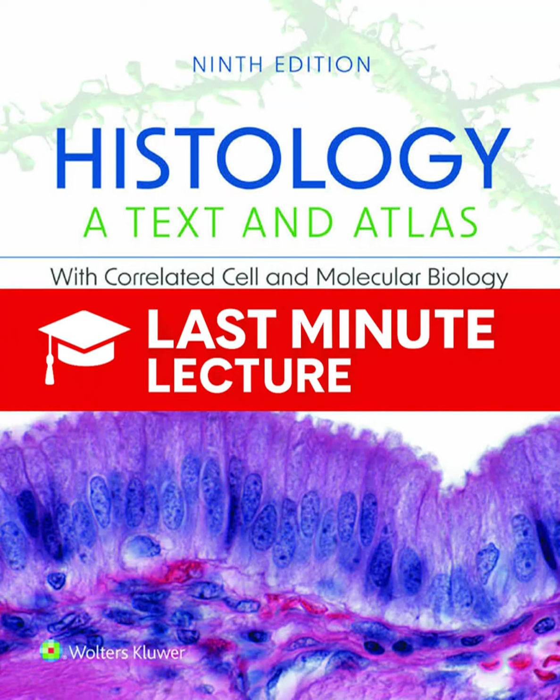And this translates directly to structures we study, like the renal corpuscle in the kidney. Precisely. Depending on whether your 5-micrometer slice goes through the exact center of that spherical corpuscle, it might look like a full ball of capillaries. But if you just graze the edge, it might look like a small ring of cells or a dense half-moon shape. You have to look at many, many 2D sections to mentally piece together the full 3D structure.